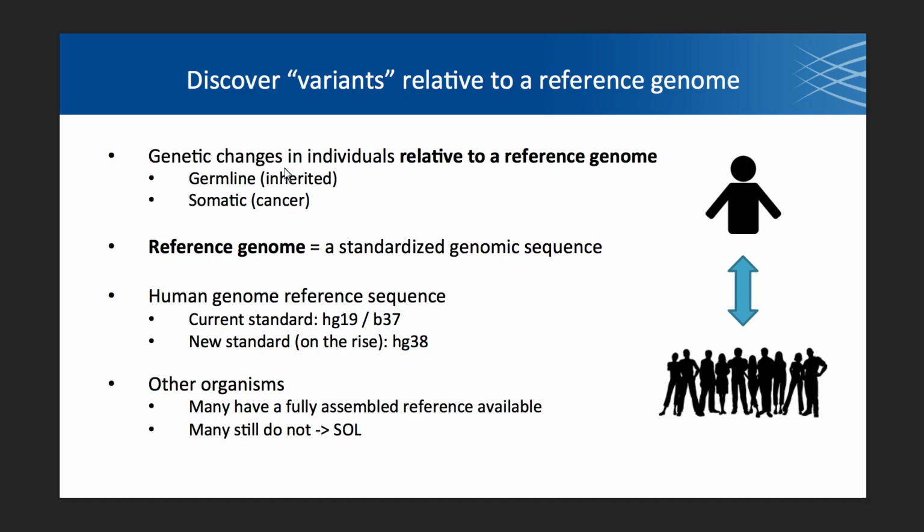For example, some of the repetitive areas around the centromeres have been clarified so you can get better alignment and so on and so forth. And so periodically, every couple of years, we do release a new reference. And you want to make sure that all your resources and all your files are all with respect to the same reference, or your pipeline's going to be throwing a lot of erroneous variants, unfortunately.